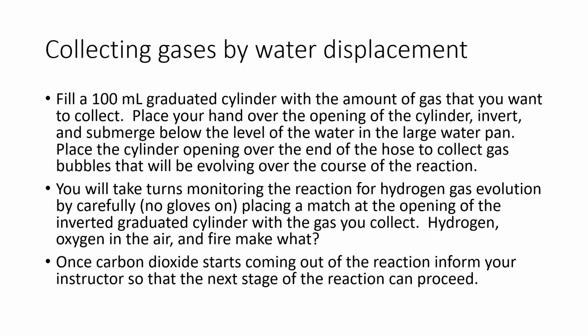And in the process, the hydrogen production will stop, and the carbon dioxide will start to bubble or to come out, and that is a confirmation for the second step of the reaction.